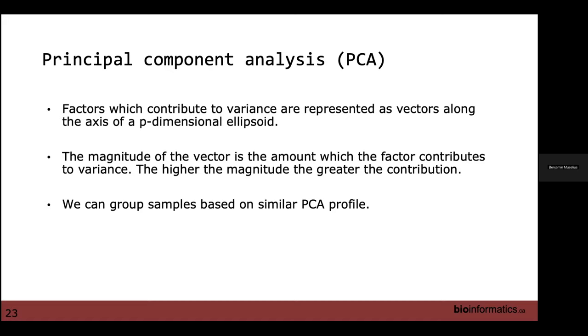Do I have a technical definition here? Yes, the technical definition for principal component analysis is that factors which contribute to variance are represented as vectors along the axes of a p-dimensional space. Sounds lovely.